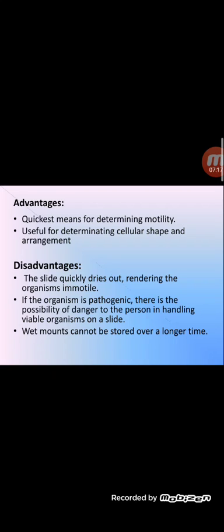And if the organism is pathogenic, there is the possibility of danger to the person handling the viable organism on the slide. And wet mounts can't be stored over a long period of time, since the slide quickly dries out. So these are the advantages and disadvantages.